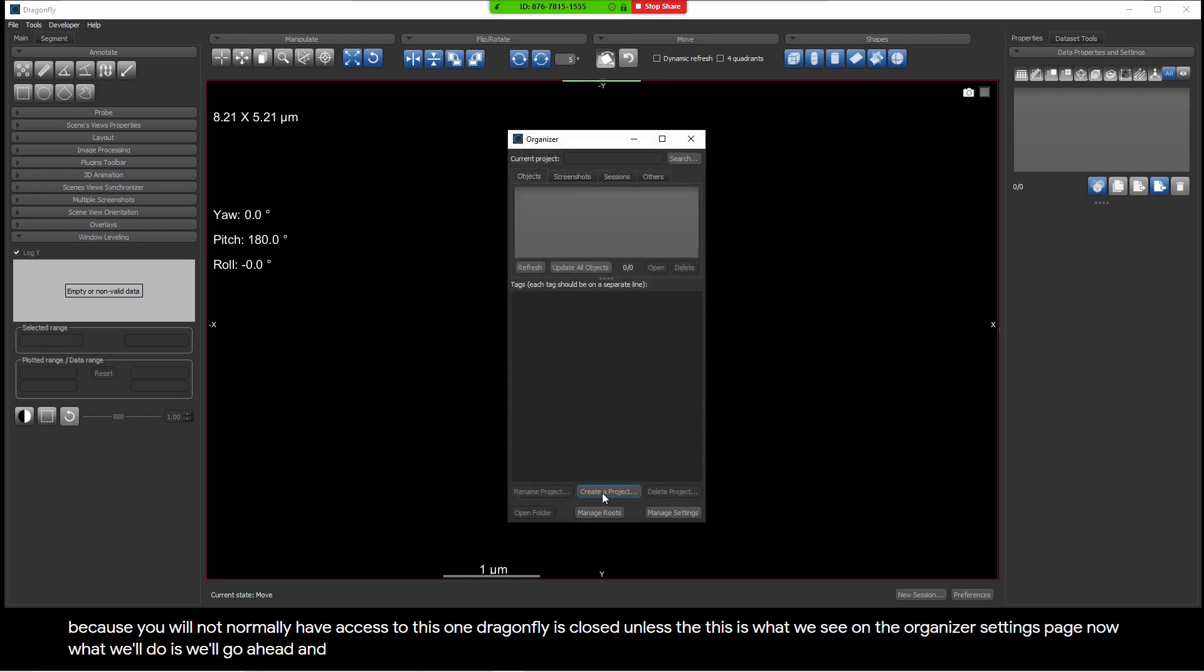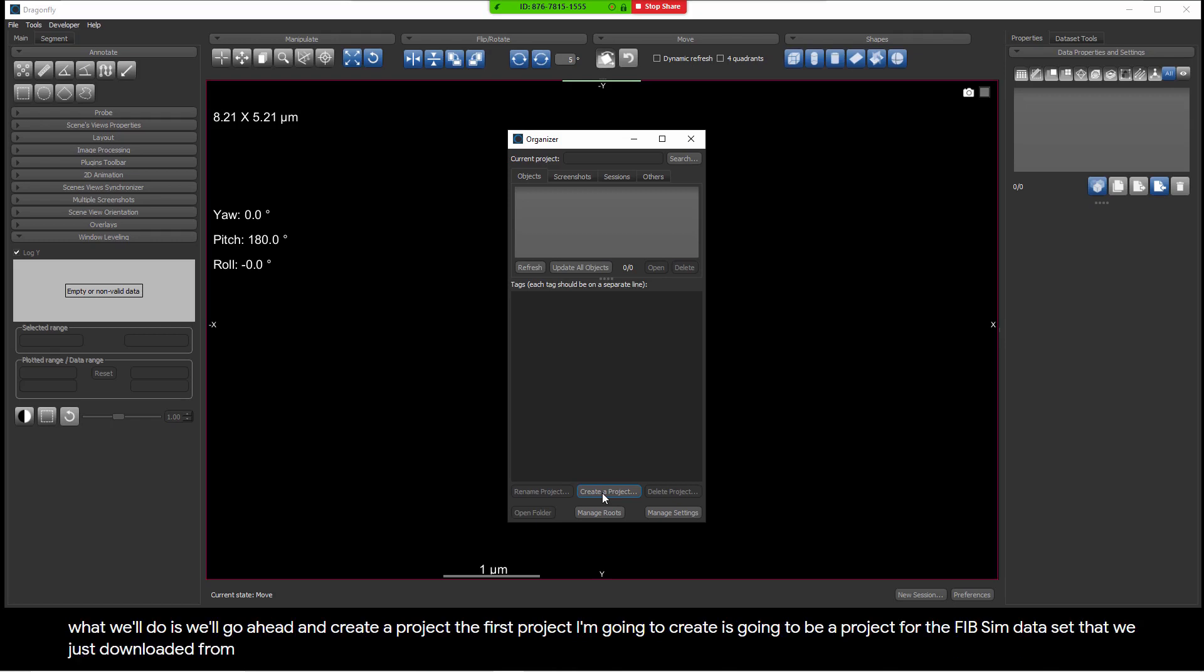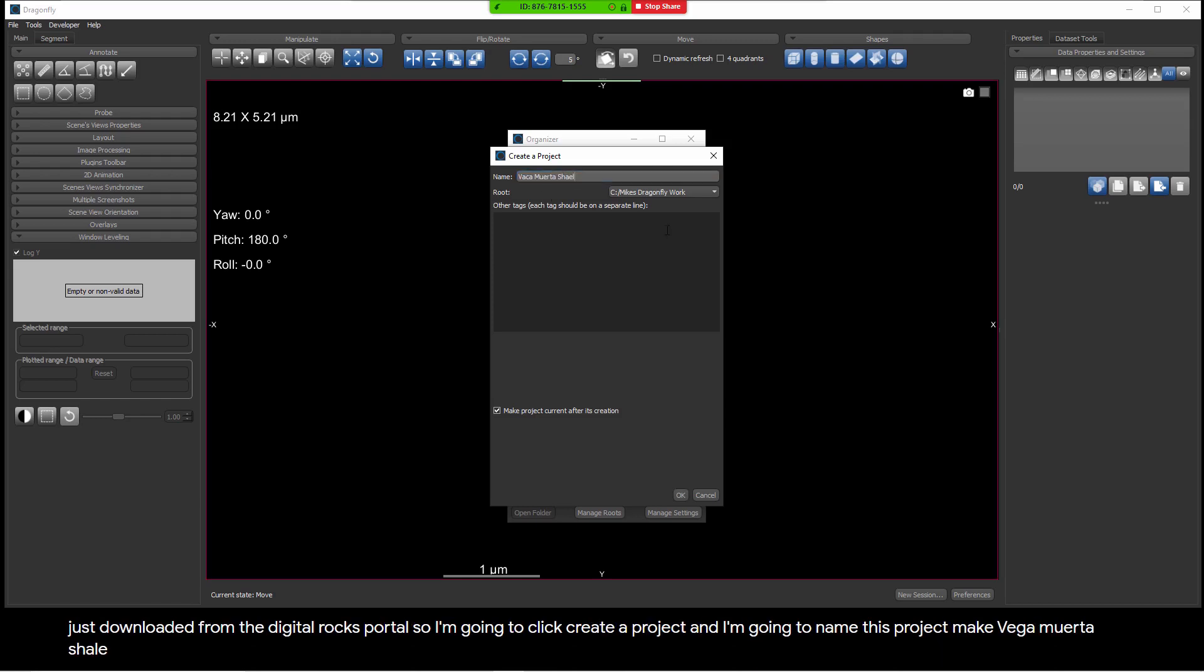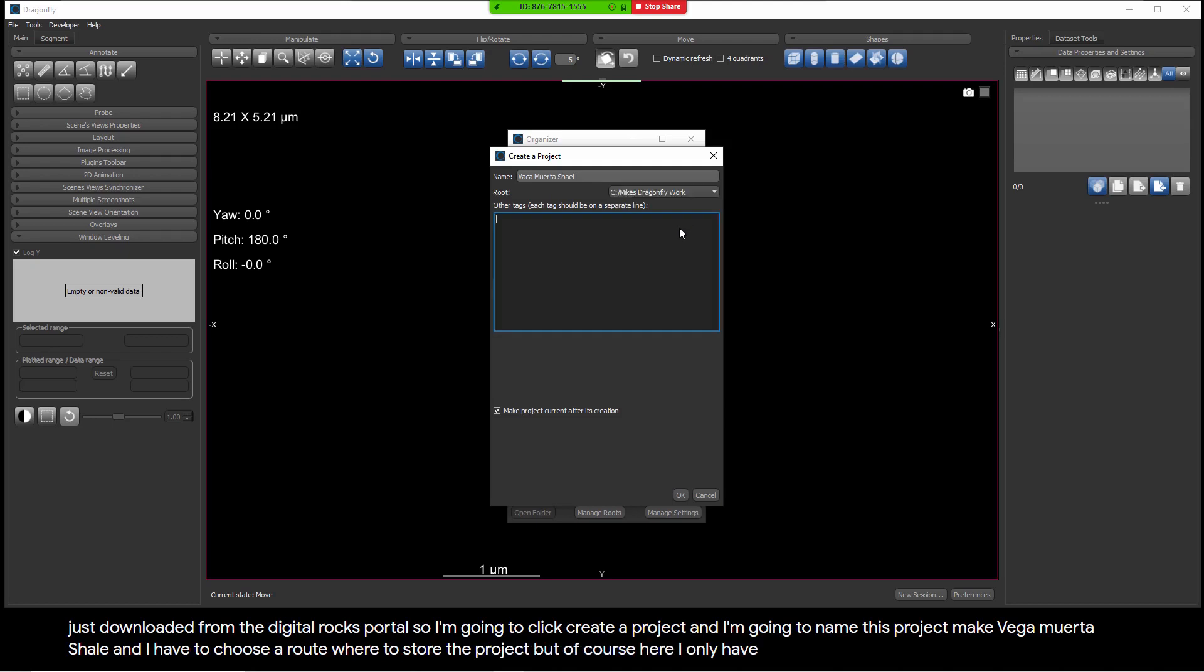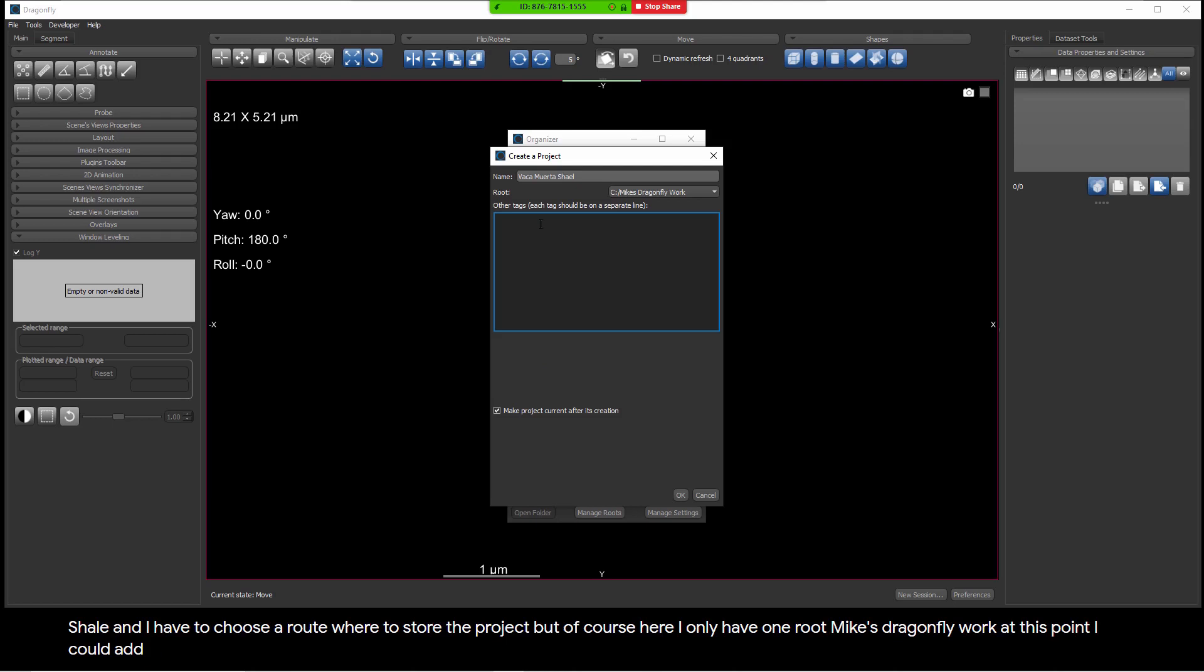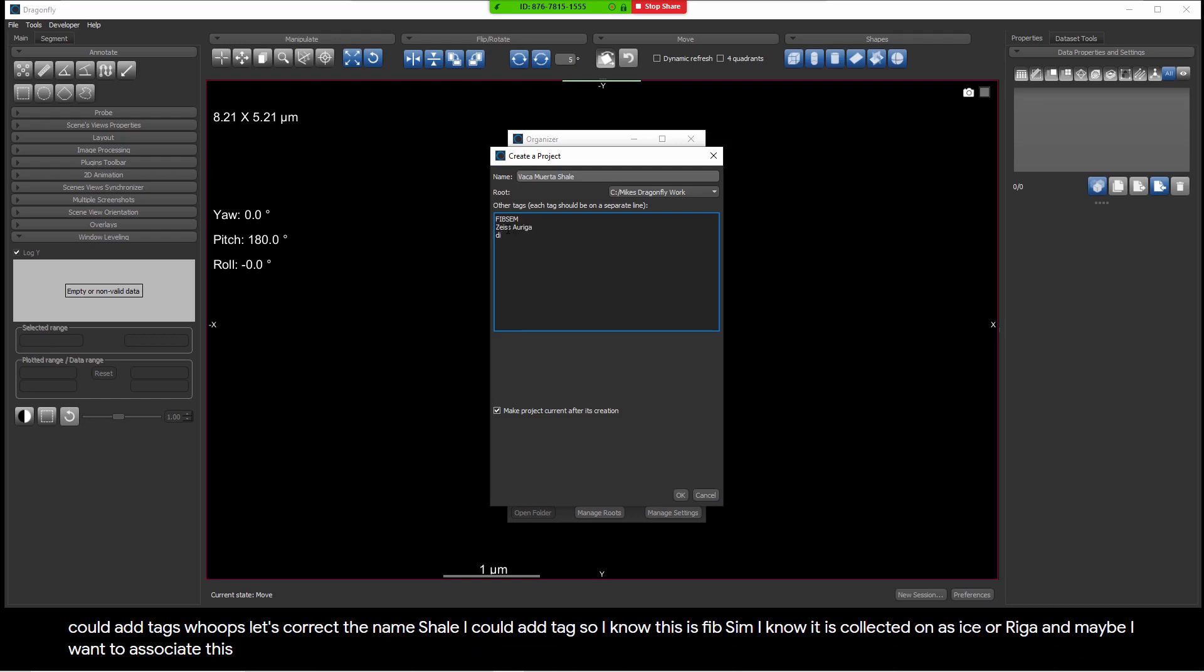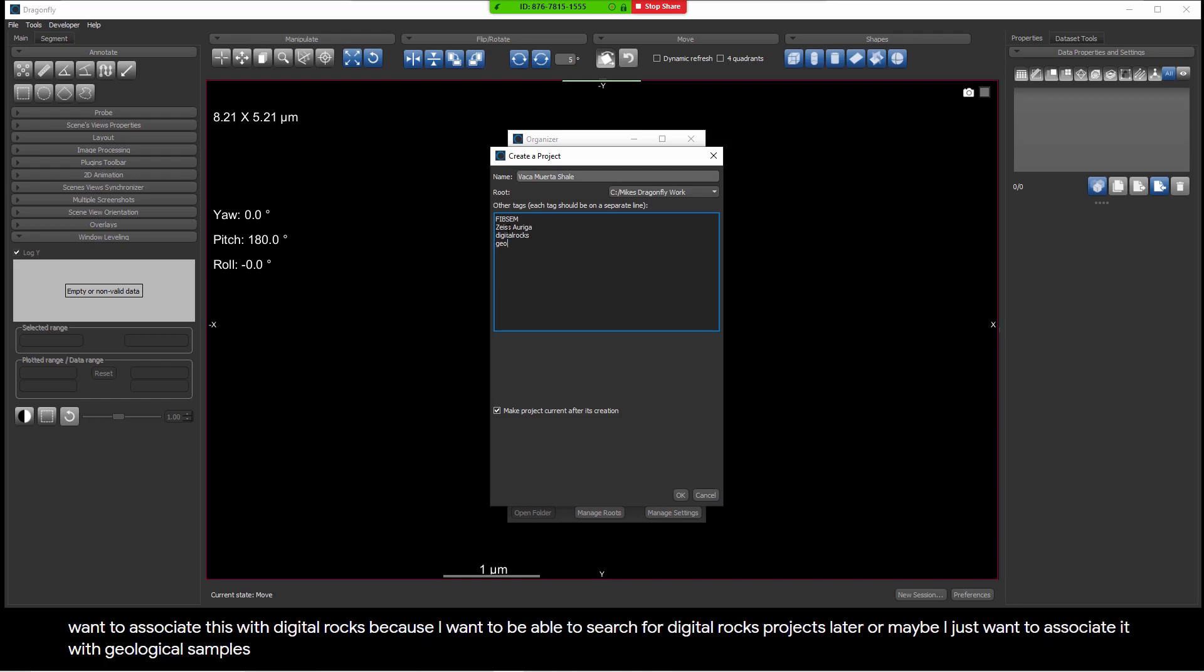What we'll do is we'll go ahead and create a project. The first project I'm going to create is going to be a project for the FIB-SEM data set that we downloaded from the Digital Rocks portal. So I'm going to click Create a Project, and I'm going to name this project Vaca Muerta Shale. And I have to choose a root where to store the project, but of course here I only have one root, Mike's Dragonfly Work. At this point, I could add tags. I know this is FIB-SEM. I know it is collected on a Zeiss Auriga. And maybe I want to associate this with Digital Rocks, because I want to be able to search for Digital Rocks projects later. Or maybe I just want to associate it with Geological Samples. So let's keep those tags for now and click OK.